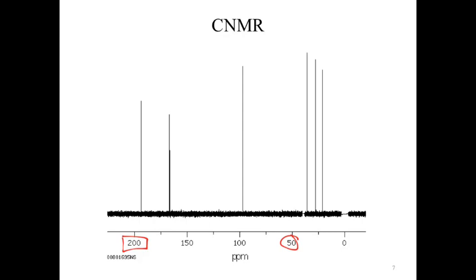So what I would expect to see, again, minimally on this, we've got 1, 2, 3, 4, 5, 6 peaks, which means 6 unique carbons. The next part of this is trying to classify where those carbons are located, so something about their chemistry within that 0 to 50 range. So as far as understanding this, we're looking at our chemical shifts.